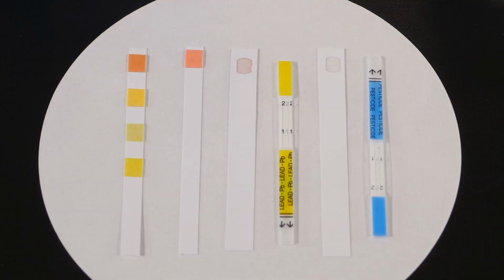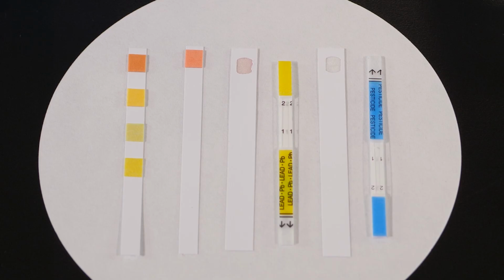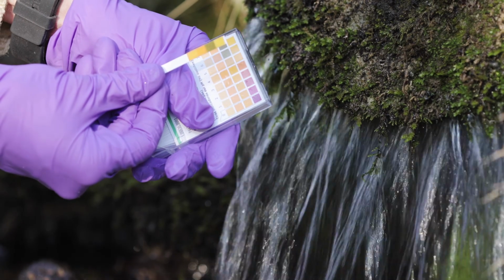Some test strips contain 1 chemical indicator, like this test strip, which is used to detect copper in water. Other test strips contain 2 or more chemical indicators. Test strips are a convenient way to test water for contaminants, even when the researcher conducts tests away from the lab.